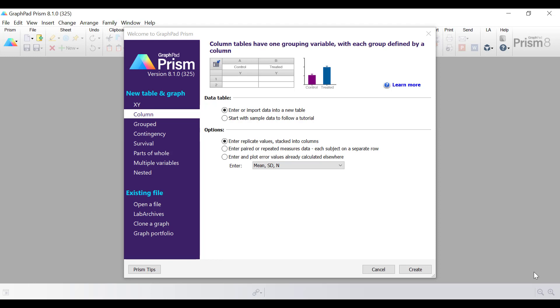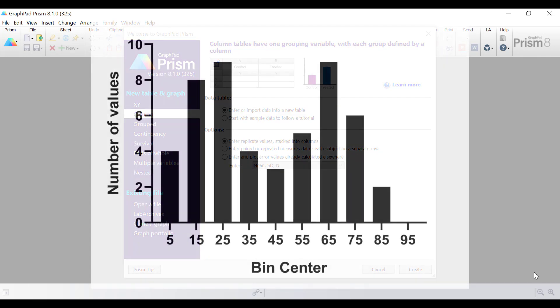Histograms are perfect for this as opposed to box plots and QQ plots, which are not really that desirable. Frequency distributions can also highlight potential outliers in your dataset, and it's very easy to find the mode — the most often occurring number — from a frequency distribution. Usually a frequency distribution involves the creation of a histogram to visually inspect the distribution of your data, such as the example shown here.